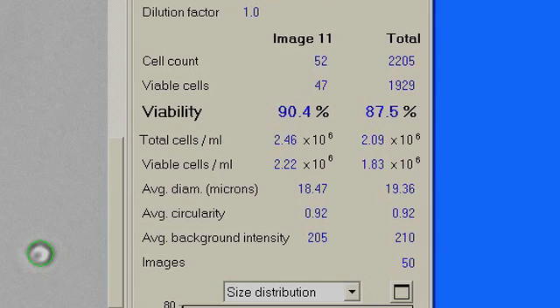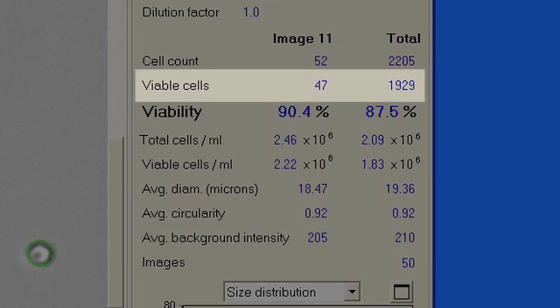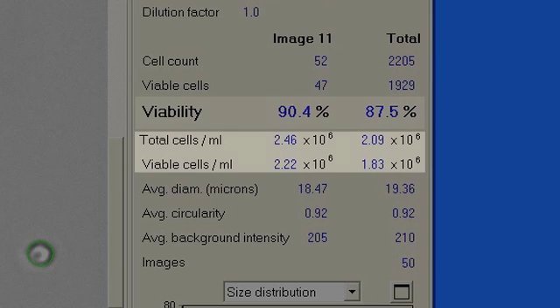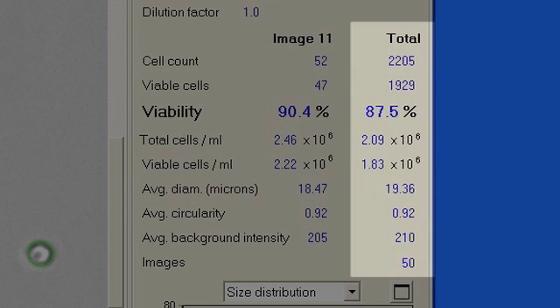Now let's take a look at the statistical portion of the screen. The first column displays the individual image statistics, including cell count, viable cell number, percent viability, total and viable cell concentrations, cell sizing, and average circularity. The last column shows the cumulative results determined from all images acquired during the run, which are the complete results of the sample.